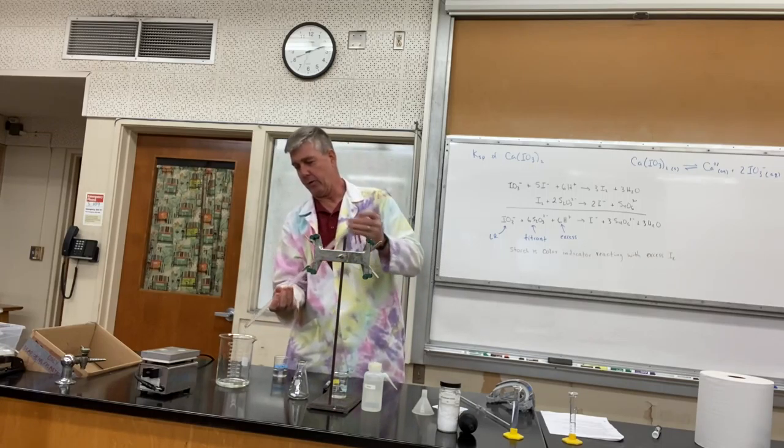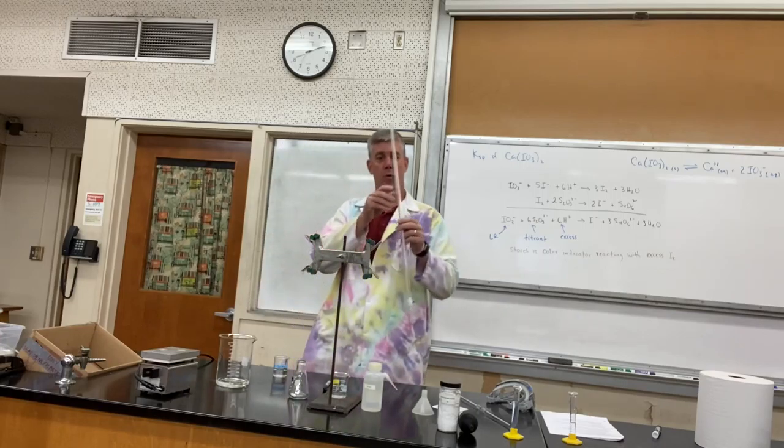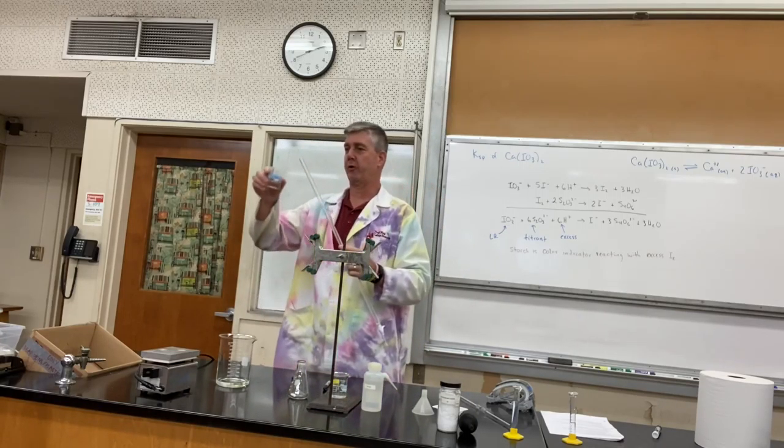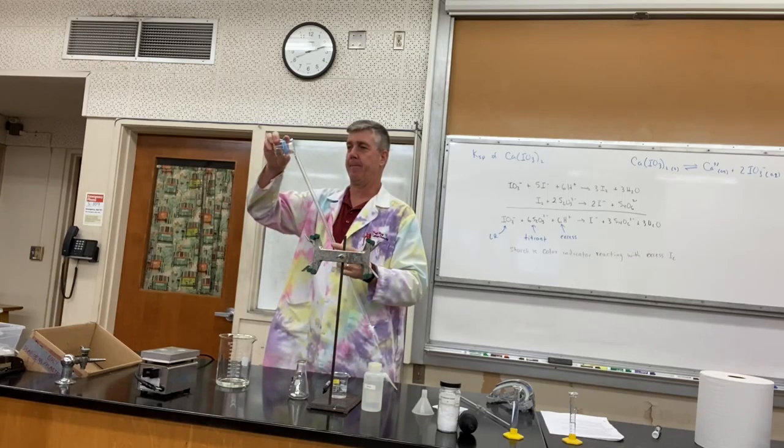And we're going to condition it a second time, just rotating the burette and draining it. And we'll do it a third time for good measure.